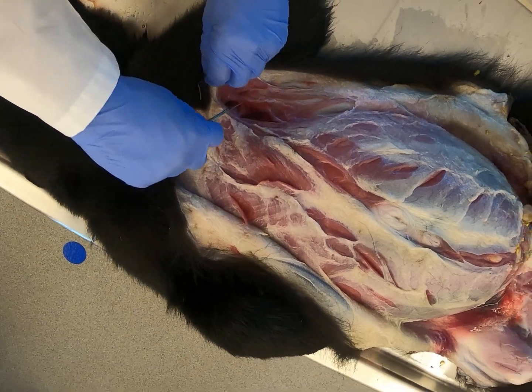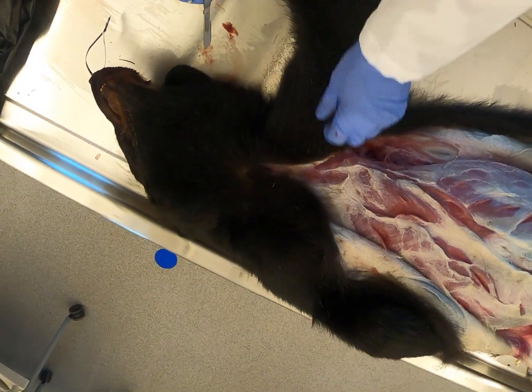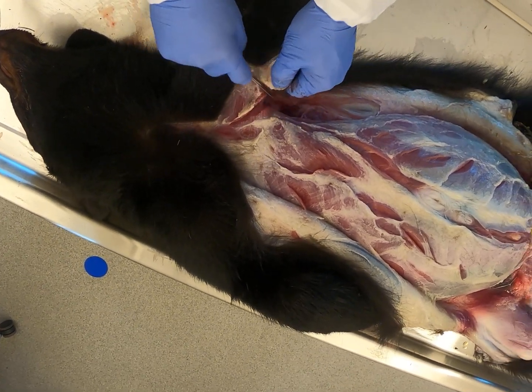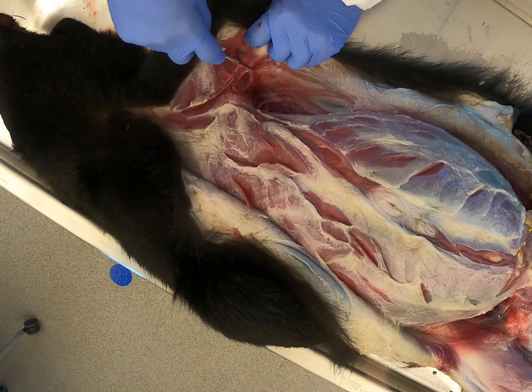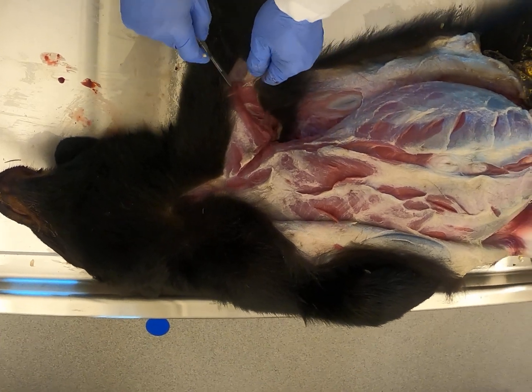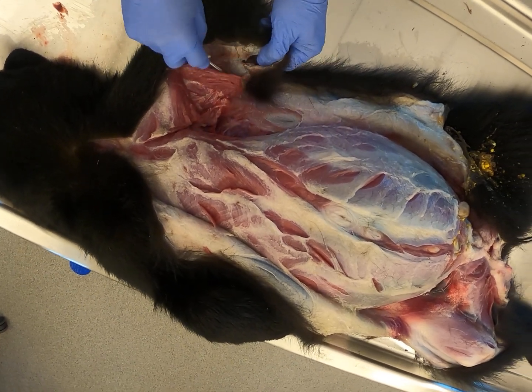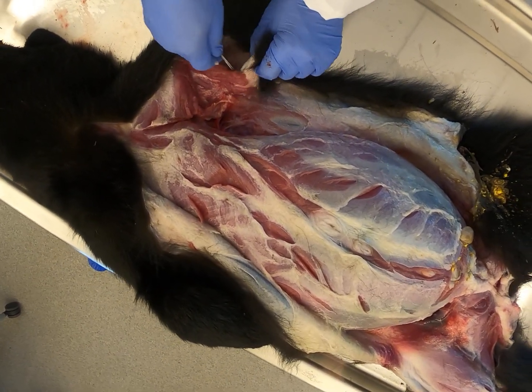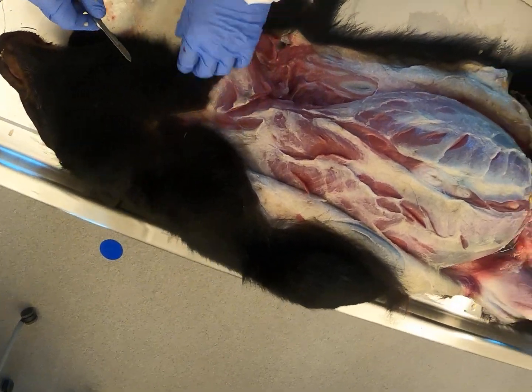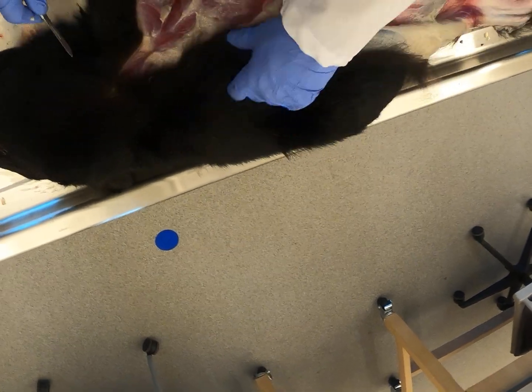Then we'll get up in this front shoulder. I'm going to skin down the foreleg. On a bigger animal or if we were processing it, we'd have it hanging and be able to work with gravity to get some of the hide off, but doing this necropsy on the table is fine because we'll be able to roll it around as needed. There seems to be a little bruising in this front shoulder area as well.